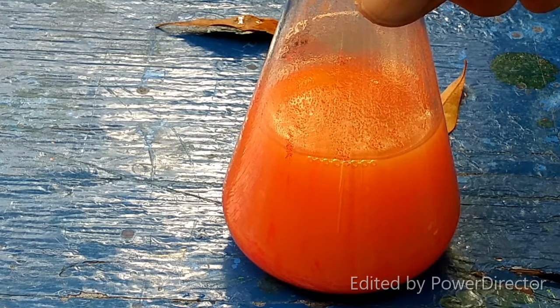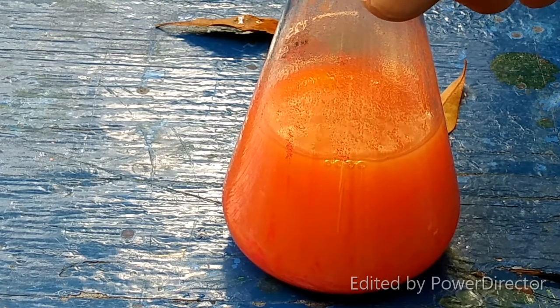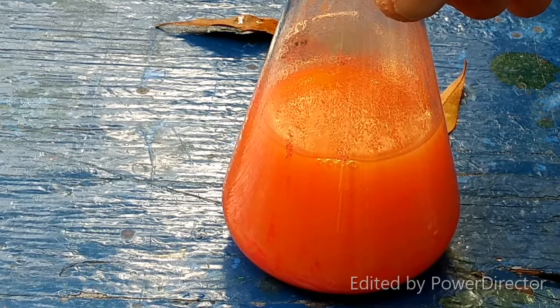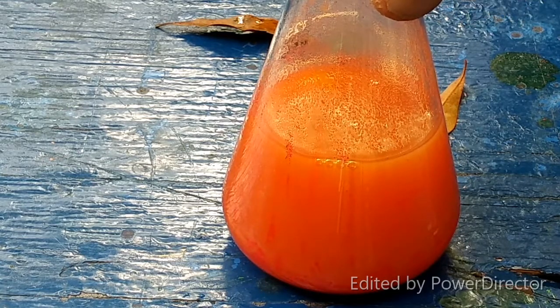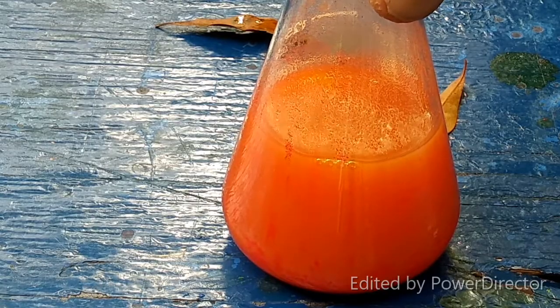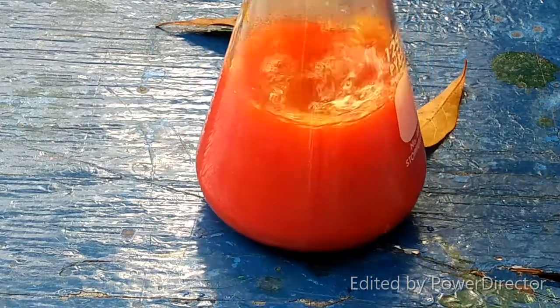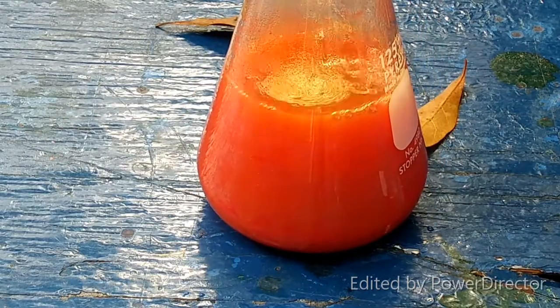And I don't know that antimony triiodide specifically will do that, but I've had that happen way too many times. It's kind of like letting your apparatus cool down without taking the glass stoppers out first. It's just not usually a good idea unless you want it to be a real pain trying to get that back out of there again. So generally it's a good rule of thumb to work with stuff while it's still kind of fresh and hasn't been sitting there forever.